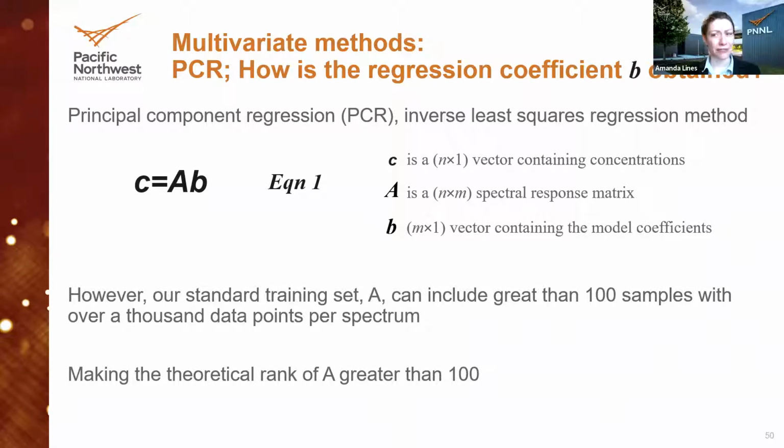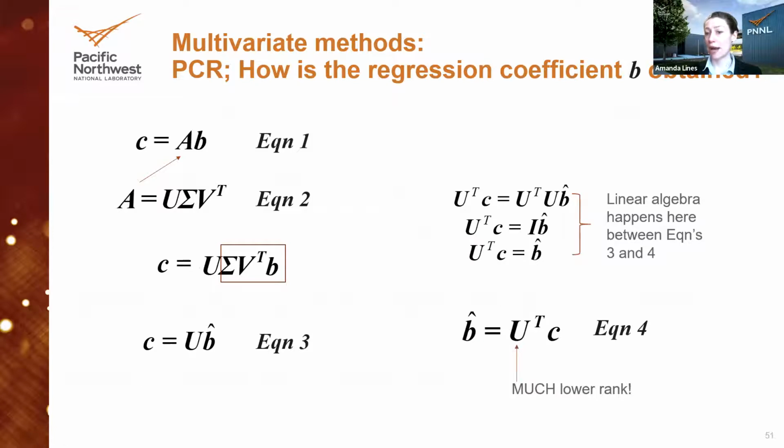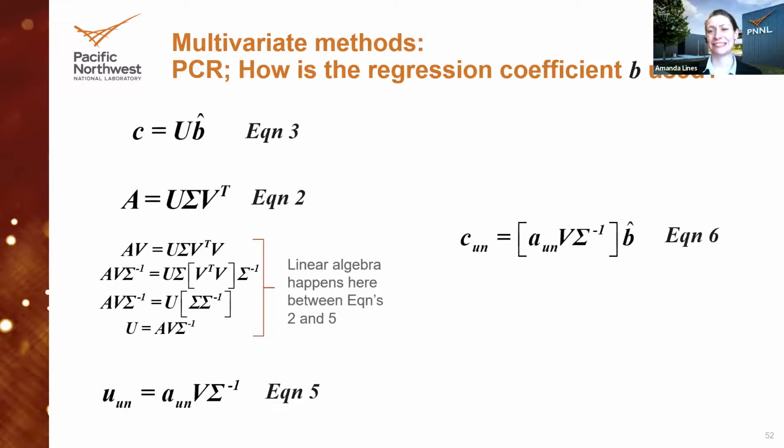So I think, if I'm understanding correctly, the question is, how does this chemometric modeling math even get into this data and start pulling out things like principal components or the information you're after? And the answer is, it, again, depends on what you're trying to go after. There's a lot of matrix math. There's a lot of ways to invert or optimize your data sets to get what you need. It's a tough question to answer without digging into the math on different modeling approaches and ultimately what they're after.